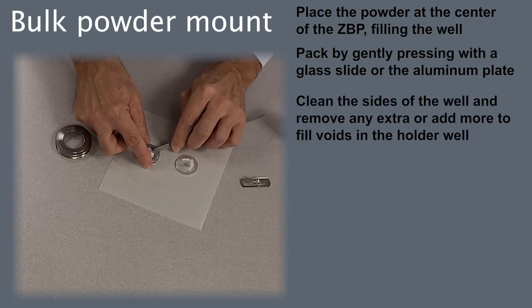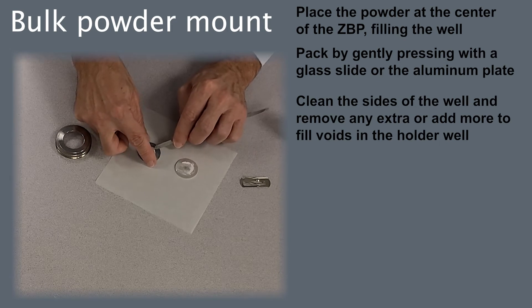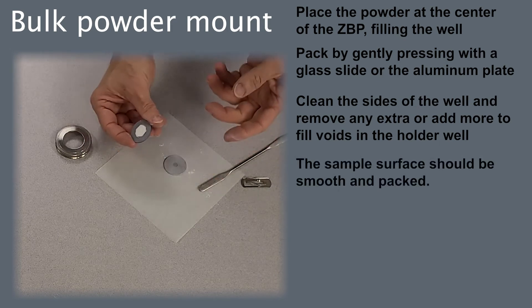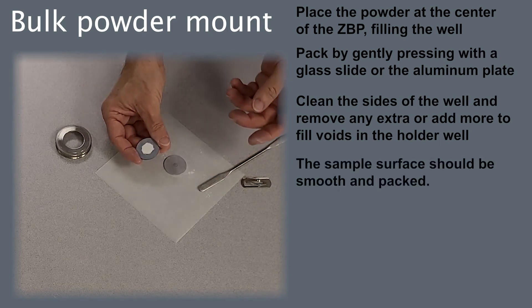Clean the sides around the well. You can add extra powder if there are voids. The sample surface should be smooth and packed.